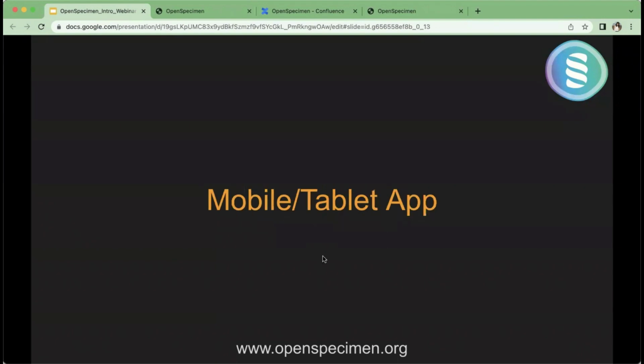We do have a mobile tablet app where you can enter data, whatever we saw, like patient registration, clinical data, and specimen data. One of the main advantages of this mobile app is that you can also do offline data entry. In case you're going off-site where you don't have access to the internet, you can enter data, then come back to the network and sync the data. So that's one of the other modules.